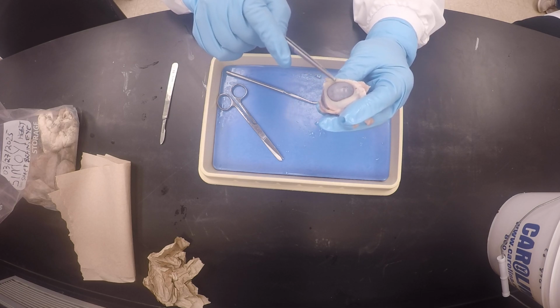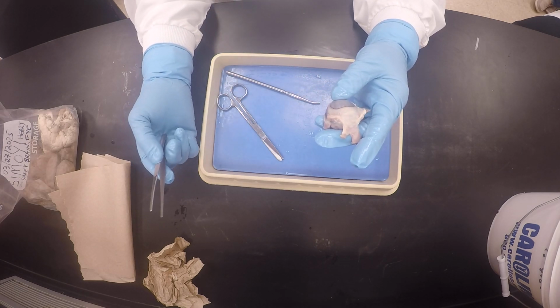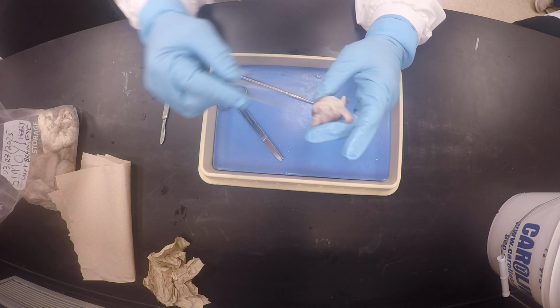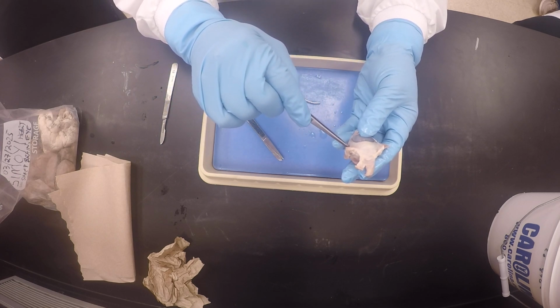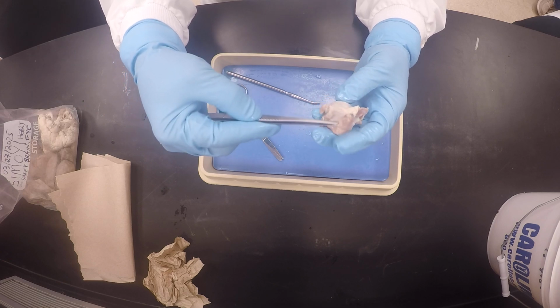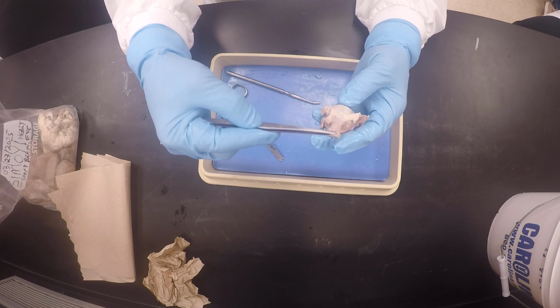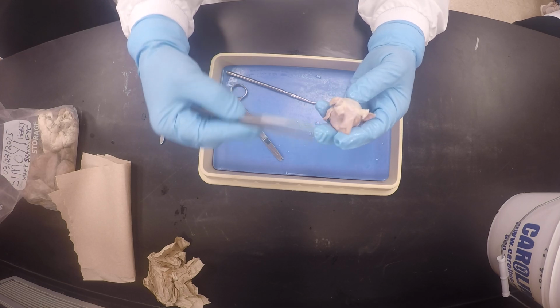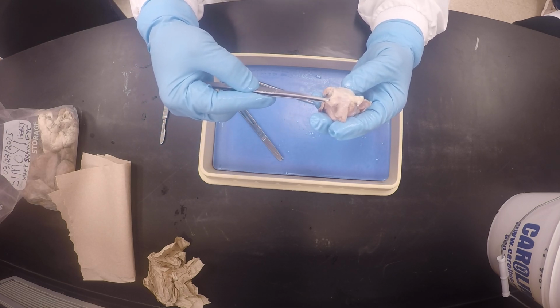So if this is the inferior side, by default the other long side has to be the superior side because it's only 50-50. And you will prove that this is the superior side because you will have two muscles again, one on the compass point, which is the superior rectus. Remember, compass point are rectuses, and the oblique ones are at an angle. So this is superior oblique. You see what I'm saying?